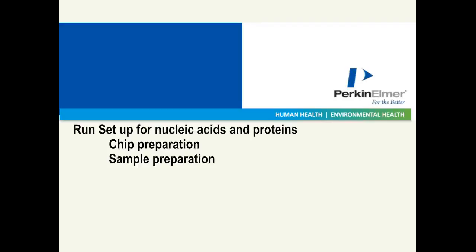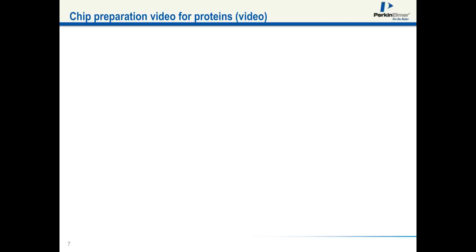Having mentioned the chips and the sample plates, Tracy is going to start with your video describing the chip preparation. Tracy, you can go on.